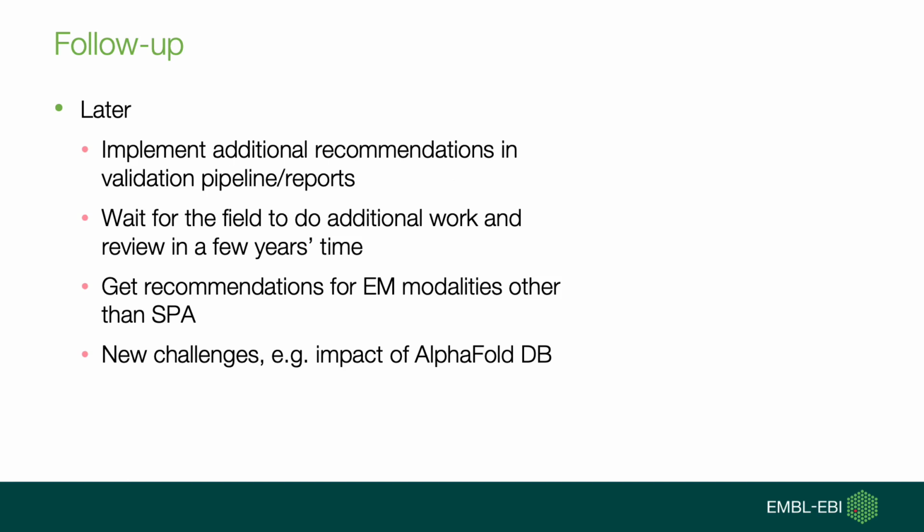We also have to wait for the field to do more work, and in a few years' time we have to go back and review some of these areas. And the meeting focused on single particle only, so we also need recommendations specifically for other EM modalities like helical reconstructions or electron crystallography. And then of course there are always unexpected developments and new challenges.